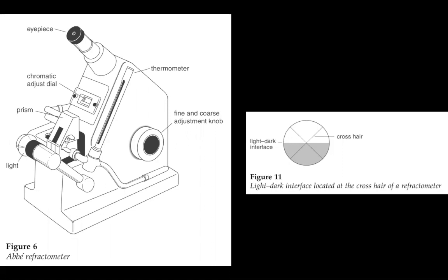The equation that I had on the last slide for temperature adjustment needs to be applied. Usually our room sits about 23 or 24 degrees C. Just to make you feel better, that equation is taped to the bench top. So you never have to memorize it. You can always refer back to it in your book. It's here both in the distillation lab as well as in lab 2, that adjusted temperature measurement. If you have any questions, be sure to contact me or one of your TAs.